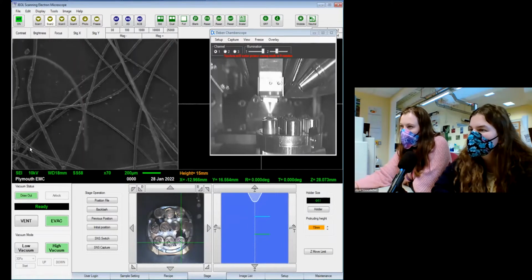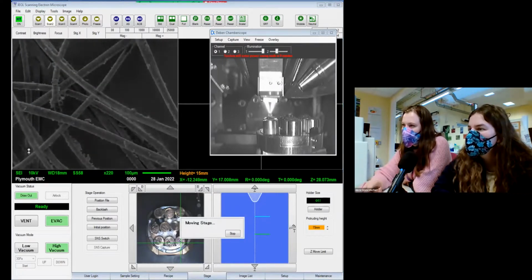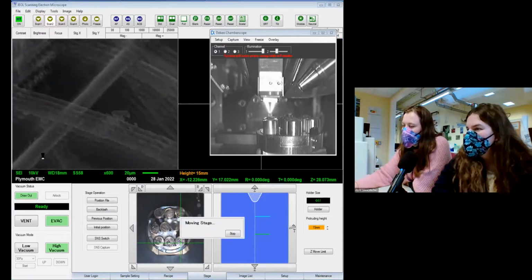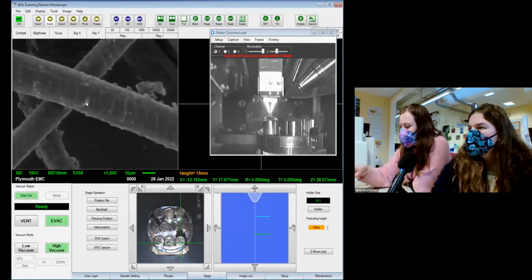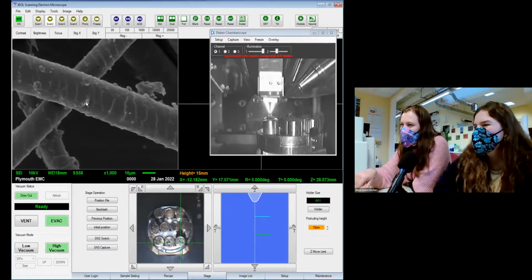That's probably a good bit to get most in. Yeah, I think that's a good idea. I like it. It's quite different. It's actually not at all like cat hair in the slightest. It's much more similar to that sort of outer coat, platey stuff. It sort of looks similar, but not really.